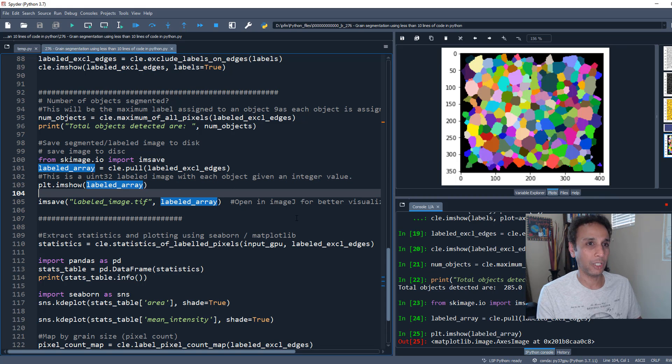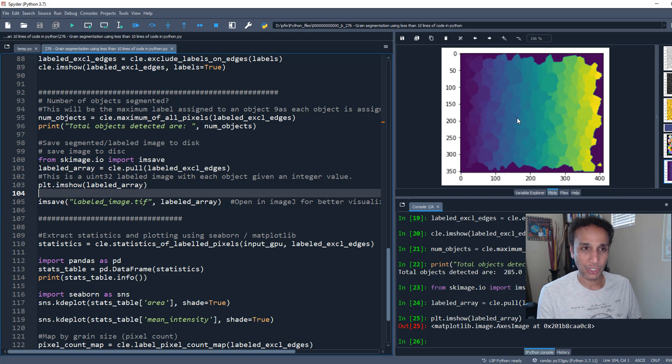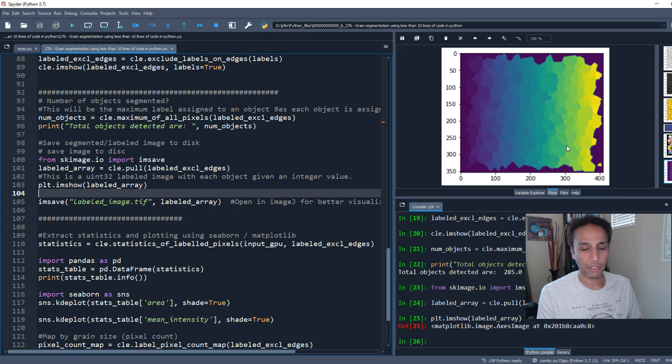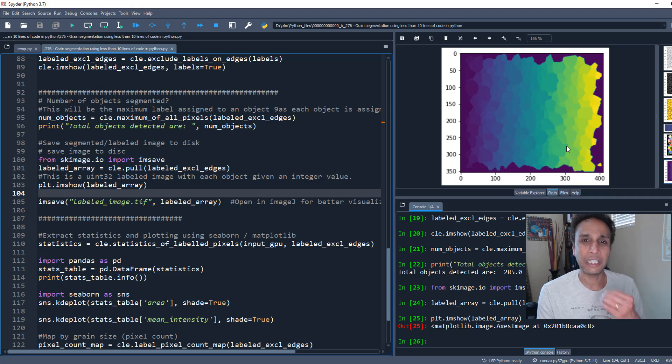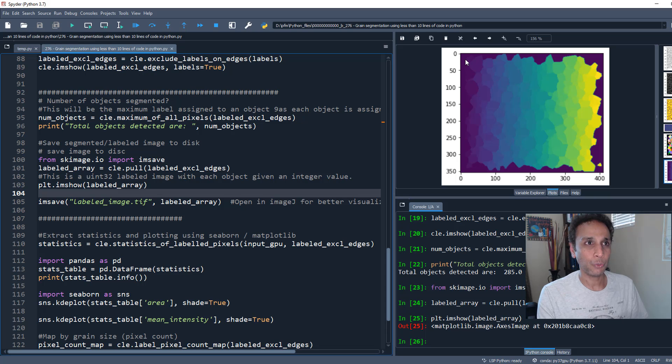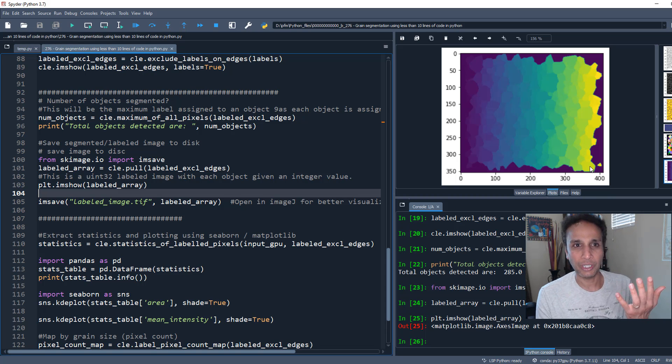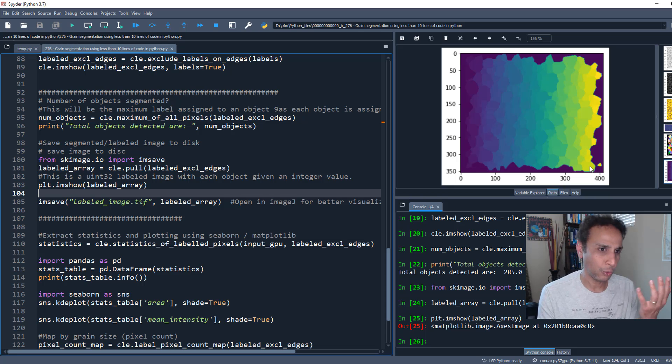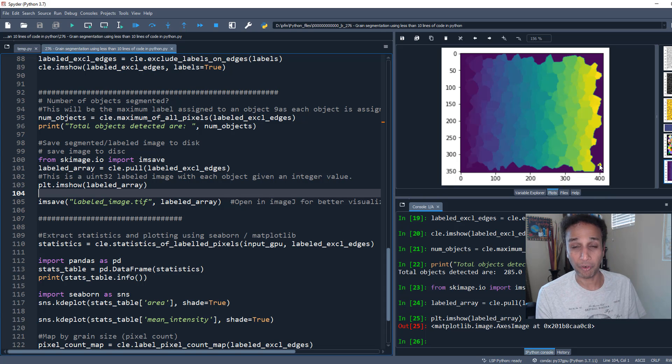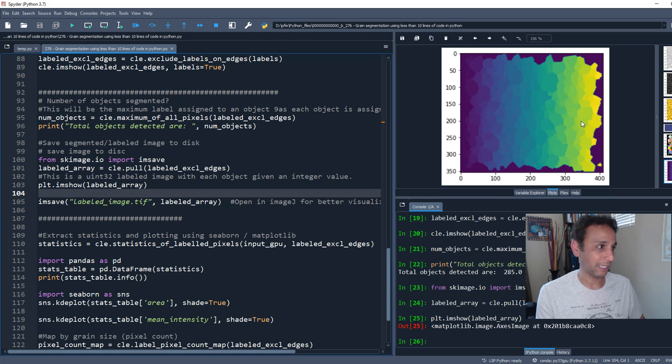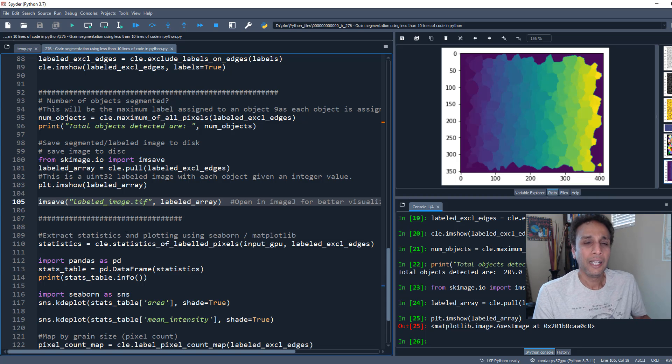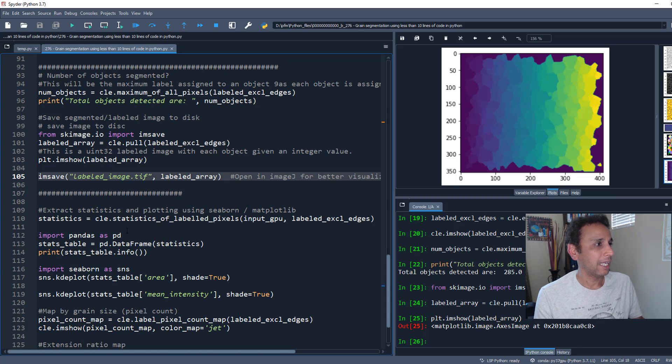I can show it using plt.imshow. There's my labeled image. Why does it look weird? Each object is given a unique value. The first one has a value of one, so it looks dark, and the last one has a value of 285, so it looks bright. That's why the intensity looks like it's increasing from left to right.